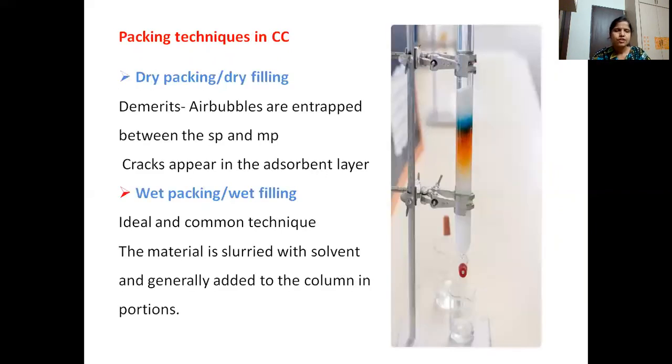After selecting a column, what we have to do is fill the column with the adsorbent we are using. For the filling of the column, we have two techniques. One is dry packing or dry filling. The other one is wet packing or wet filling.